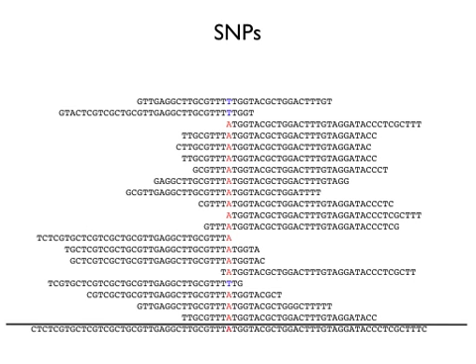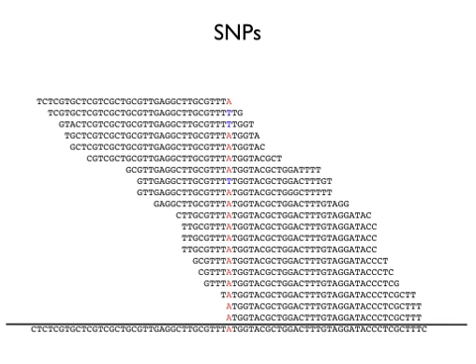And now if it's a false positive, how come it's so systematic? It's only T and A. So the first thing we noticed, and a lot of people noticed this, is that these errors, these T's that were coming up by error, were towards the end of the read. So this is the same data, but now I have ordered the sequences by where it appears in the read. So in the first one, the supposed SNP is in the first location. We call it the first cycle.